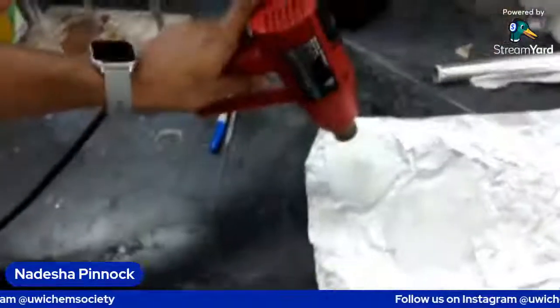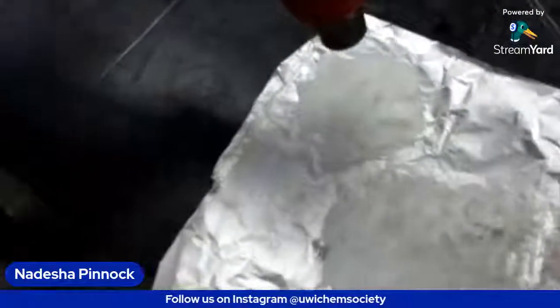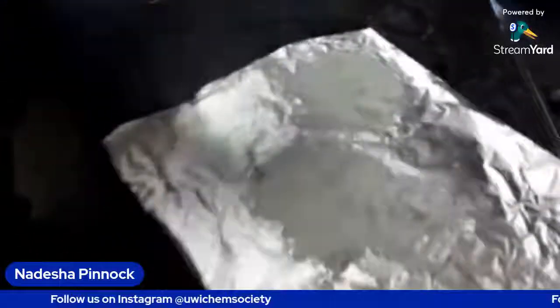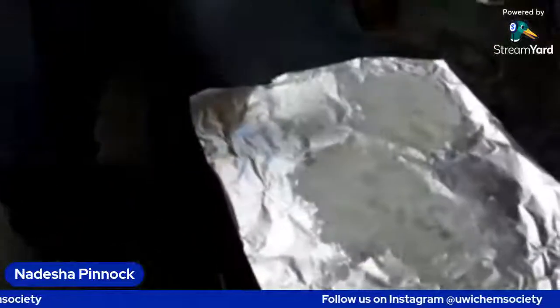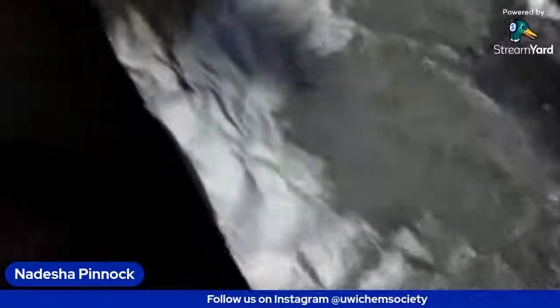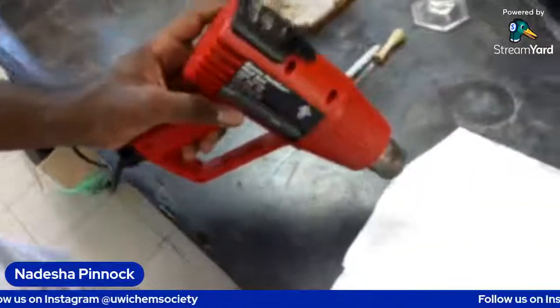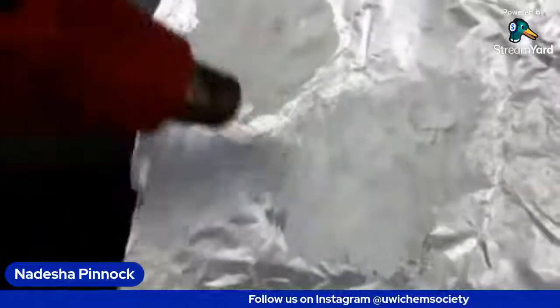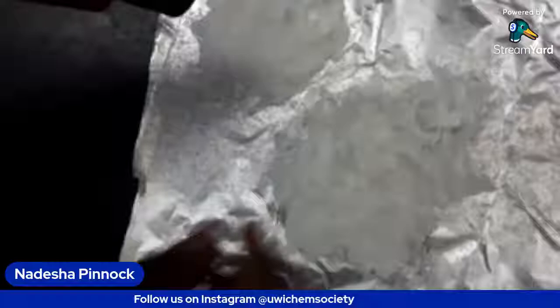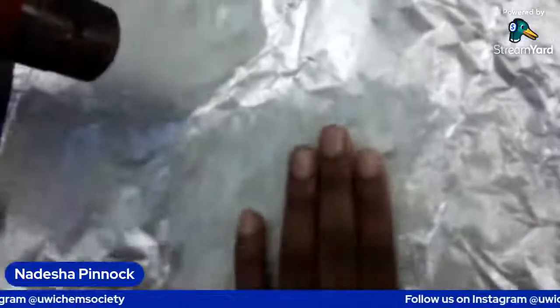So guys, we are using a heat gun at the moment, and that's to help add some heat to the product to get it to dry faster and finish the reaction, as the master chemist said. So this is like a chemist's blow dryer, you can call it that. So it's a heat gun, and we're adding some heat to the product. And it's pretty hard, so don't do what I just did.